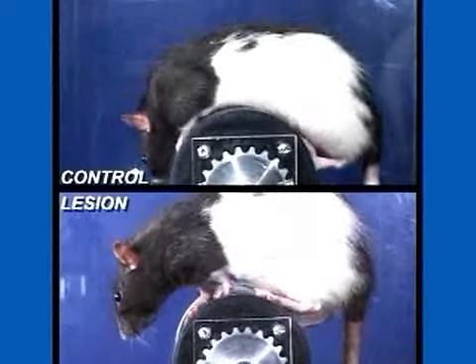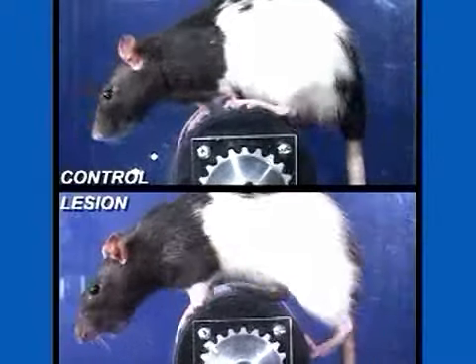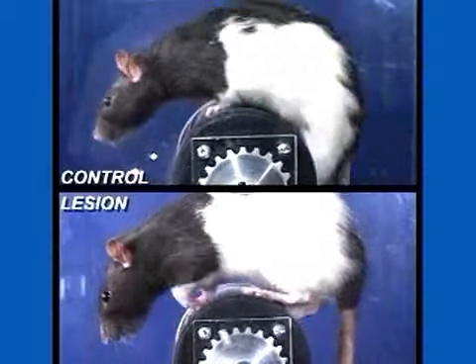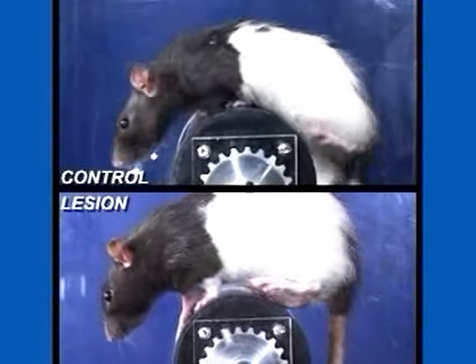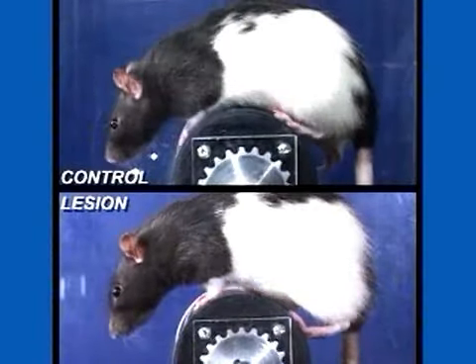The control has a longer stride than the 6-OHDA animal, with forepaw placement occurring further forward on the drum and hindpaw release occurring further back. Note that the lesion animal's posture is rigid with the head carried low and steady. The control's hindpaw typically overlaps the forepaw during a complete stride.